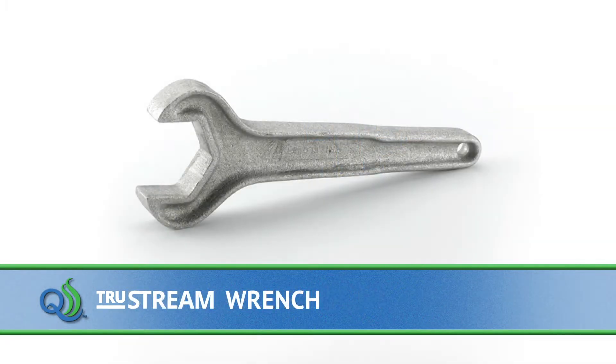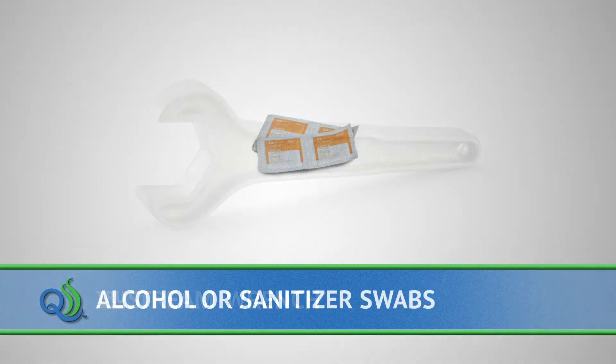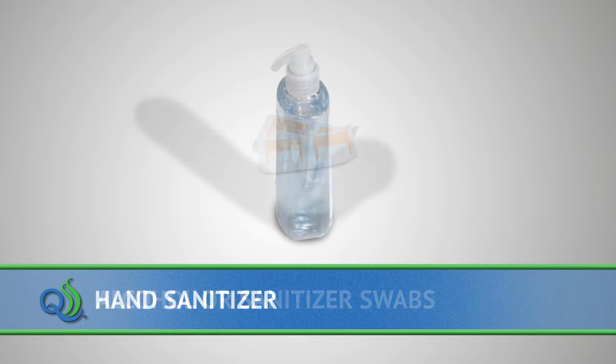A wrench for tightening the nut used to hold the septum in the QualiTrue port, alcohol or sanitizer for swabbing the inside of the stainless steel port and a separate swab for cleaning the surface of the QualiTrue sterile septum prior to needle insertion, and hand sanitizer to clean hands before sampling.